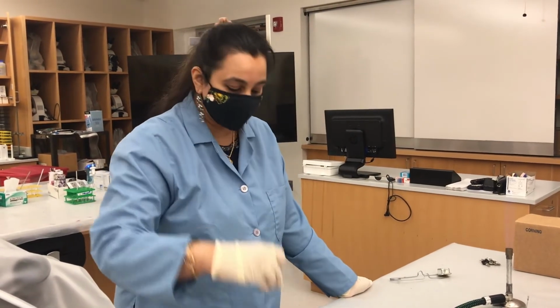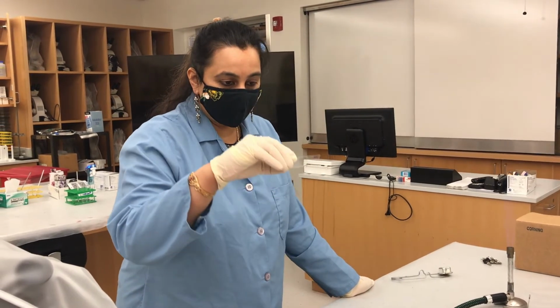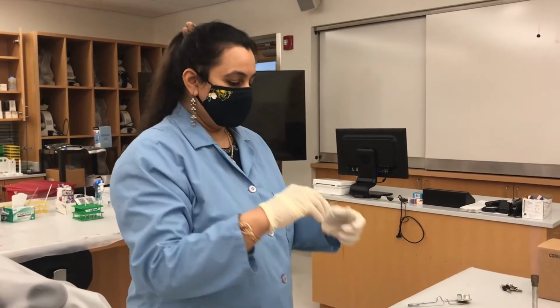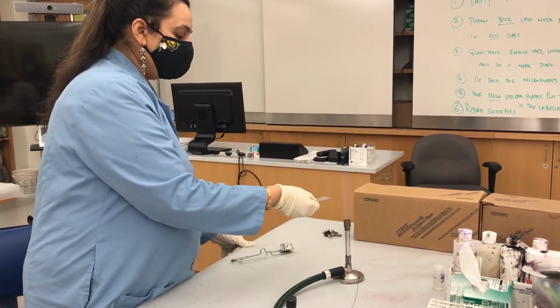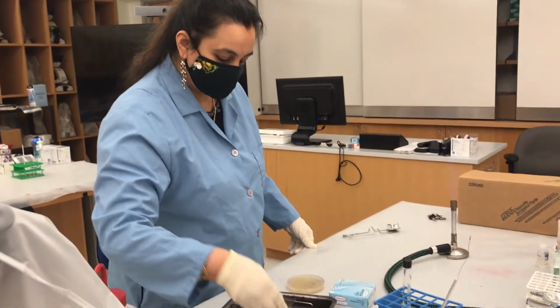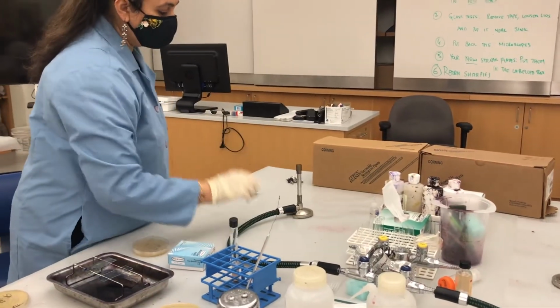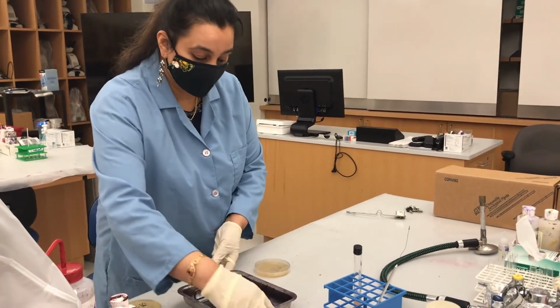So we made the bacterial smear using the solid culture, and now my liquid culture is almost ready. I don't see any visible liquid. It's all dried up. So there you go. 1, 2, and 3. Okay. I do not need the Bunsen burner now, so I'm going to turn it off and make the space ready for the gram staining technique.